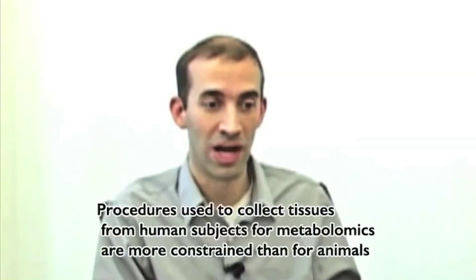Can you give us any recommendations regarding the collection of human tissue samples for metabolomics? Yeah, so human studies are obviously going to be a bit more constrained than studies performed in animals. It's essential that sterility be maintained and that minimal damage be induced to surrounding tissues. So obviously all of these things come with collection.